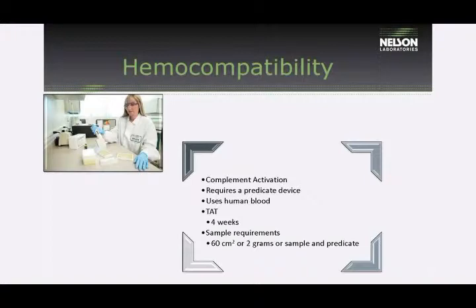Okay, so the next test is the complement activation. And this is the one test that, like I said, 2 or 3 years ago, we weren't seeing a whole lot of requests. But because of concerns from regulatory agencies, we've seen a big increase in this test. Most devices that have contact with blood have been using this.